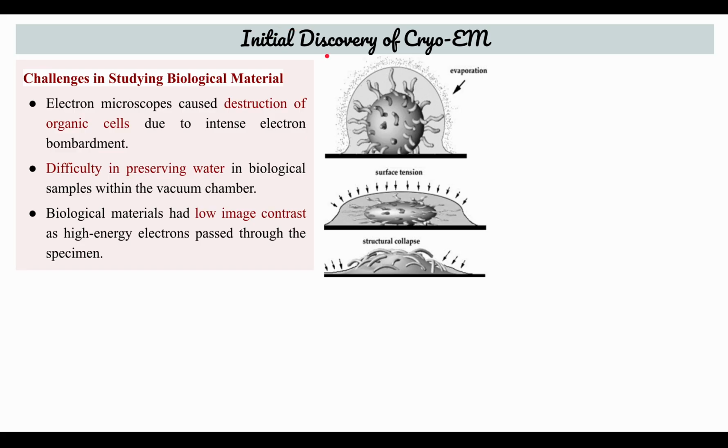Now if we talk about cryo electron microscopy, this technique comes under electron microscopy. Cryo means when you are observing the sample at cryogenic temperature, so that is known as cryo-EM. Challenges in studying biological materials.